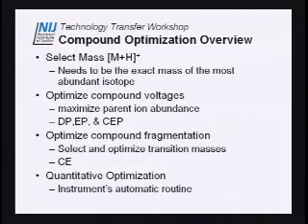And the last thing is, I've written on here, the quantitative optimization, which is the instrument's automatic feature for doing that. It's the routine that it does. You plug it in, you enter the exact mass, 303.2, go. And it does it, and then it tells you it's too concentrated, and then we have to stop and dilute it and then do it again. But that's the instrument's automatic routine.